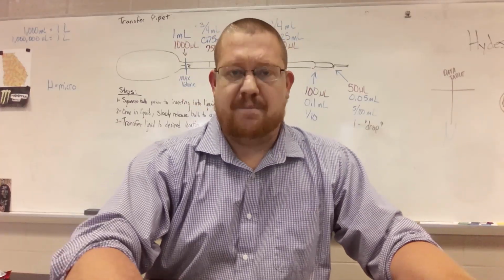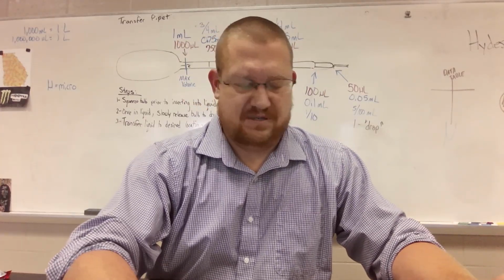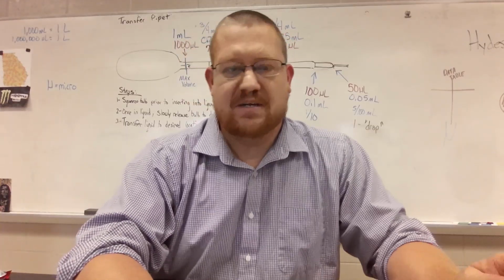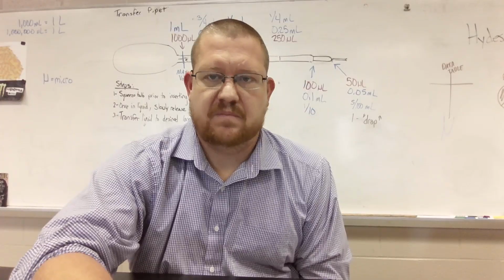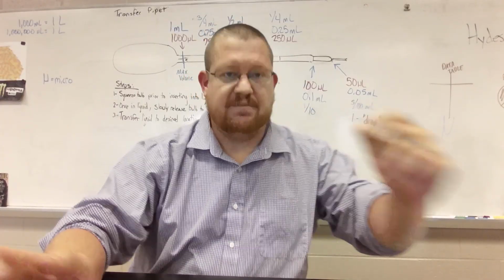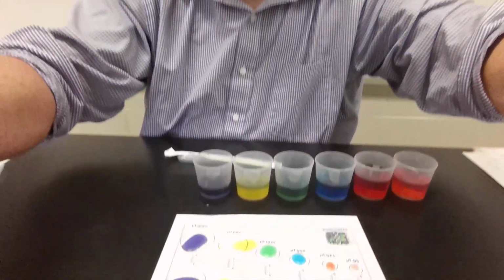So I'm going to pause this real quick and drop some milliliters of colored water on this card so you can get a look at what it will look like. All right, so I just used the pipette to pipette some colors over to give you an example of what this looks like.